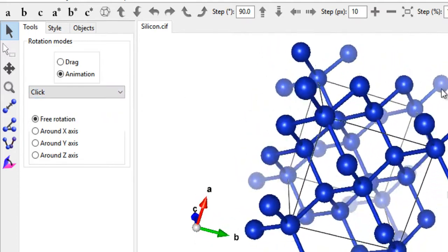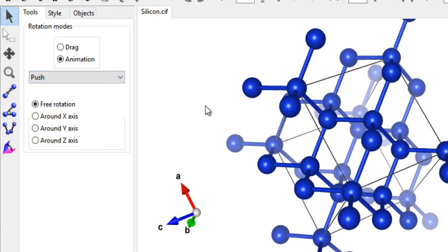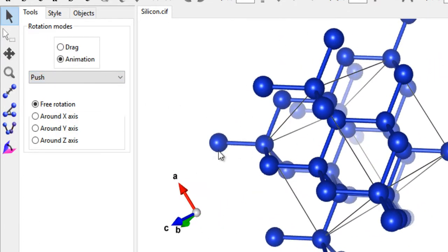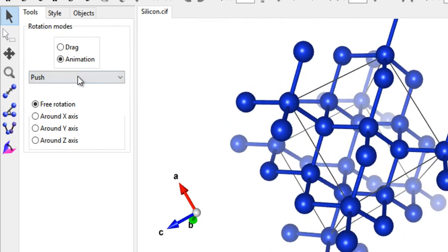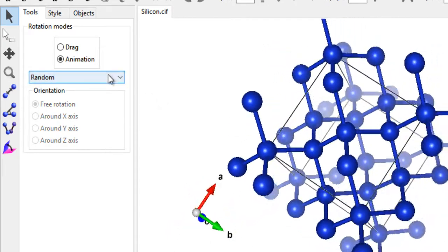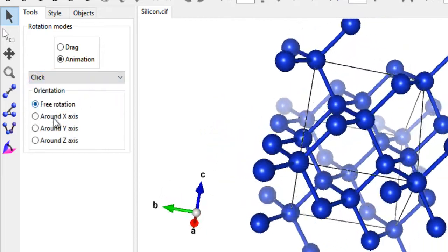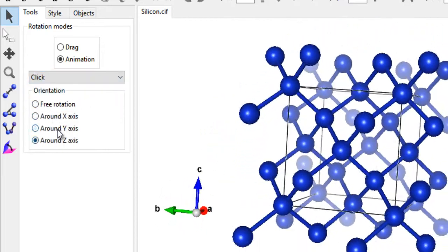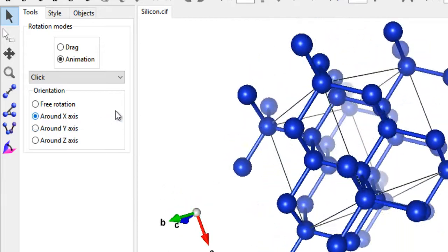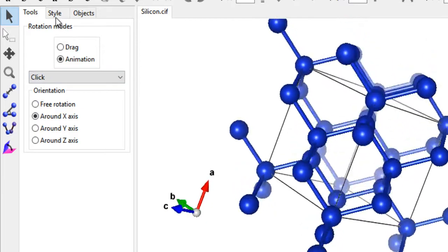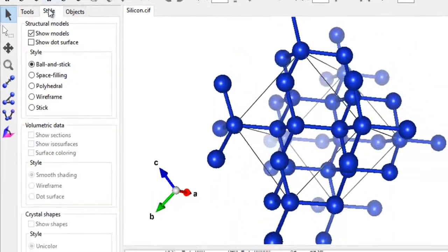Under tools you have a cool animation effect — click in whichever direction you want the crystal to rotate. There's a push option where you slide your mouse to rotate the crystal, a random animation that rotates in a random manner, and options to constrain rotation to a particular axis.